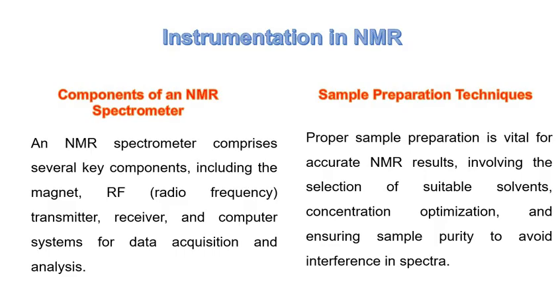Proton NMR. Sample preparation techniques. Proper sample preparation is vital for accurate NMR results, involving the selection of suitable solvents, concentration optimization, and ensuring sample purity to avoid interference in spectra.